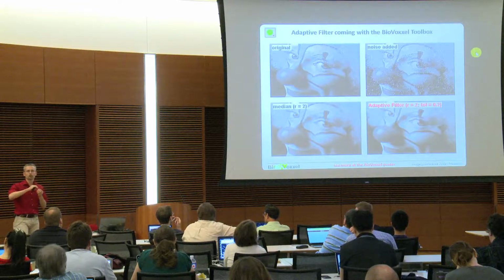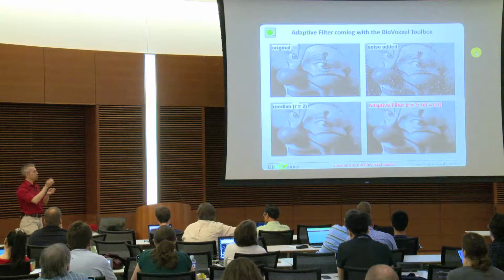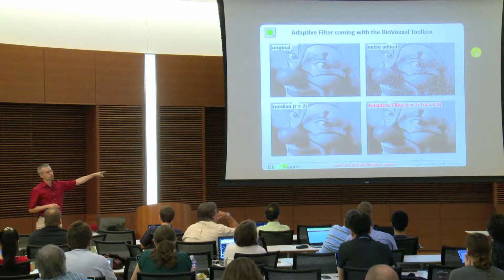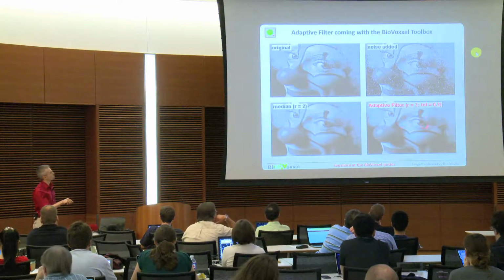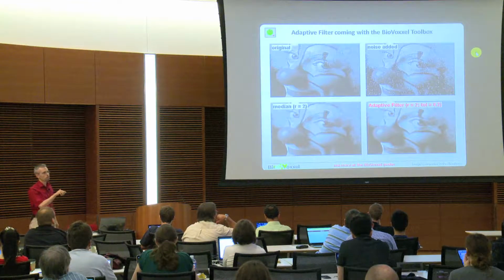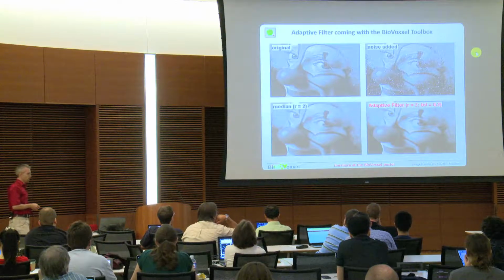So this means which have a stronger difference to their surrounding, and keeps the other pixels of the original image. So that's why you change specifically only those pixels which are outliers, and the outcome is a little bit more similar to the original. It's not perfect, nothing is perfect, but it keeps the original values slightly better.